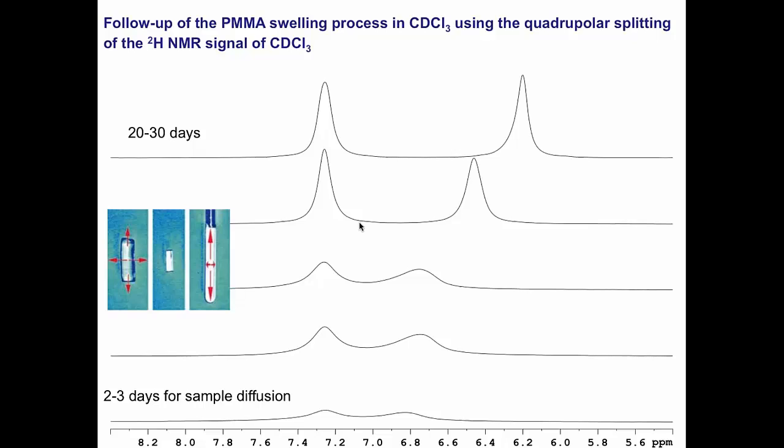And then will you put your sample first with that uncertainty? Probably not. And then if you want to diffuse the sample inside the gel, then what happens? You have to put a solution on top of the gel and let it self-diffuse, and that will take 2 to 3 days.